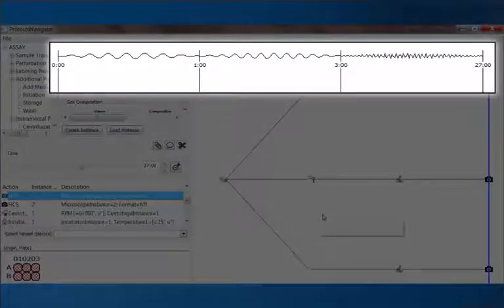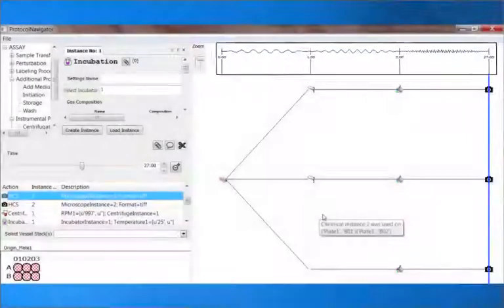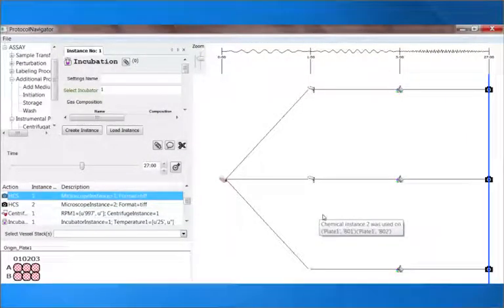As you may have noticed, for each activity, the timeline on the canvas is redrawn. More time difference between 2 time points, more is the wiggle. So the timeline provides a temporal pattern of the experiment.